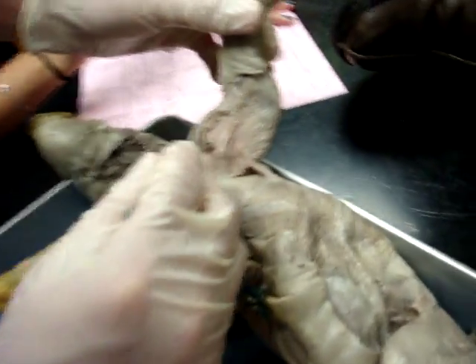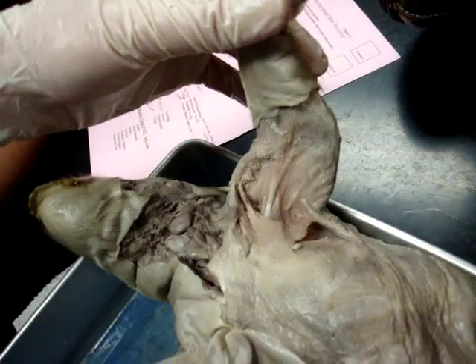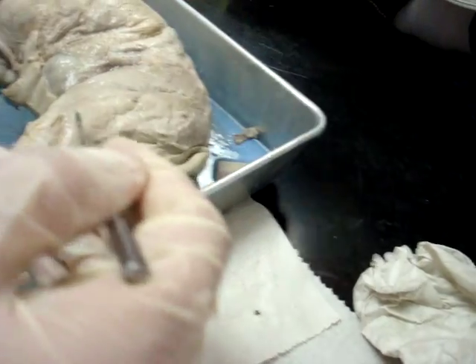Now I turn it over to my esteemed colleague. This is the umbilical cord. Biceps brachii is going to be that guy — it's up on the top, not the middle of the forearm. Biceps femoris — butt muscle. Actually it curves this way, kind of goes like... yeah.